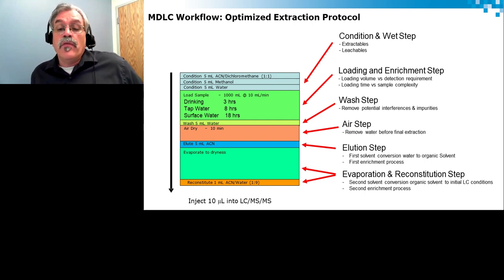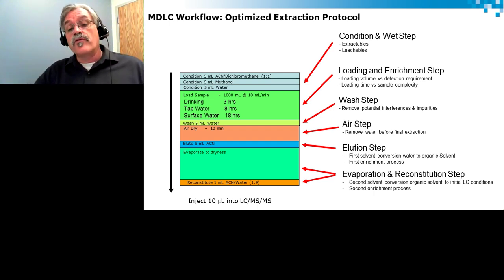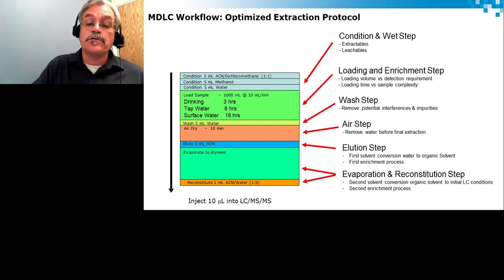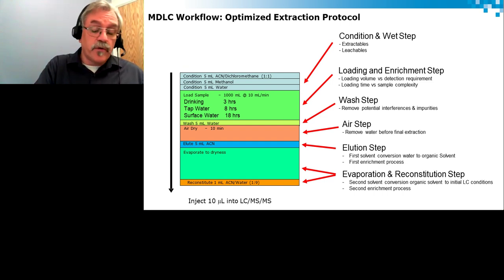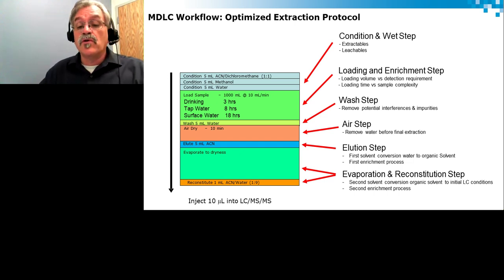Now, this is actually where a lot of extractions will finish. It's a common point for reverse phase chromatography. Because we start with a rough or raw sample, it goes into an organic layer. That organic layer has to be brought back down to dryness and reconstituted in an initial mobile phase. Usually the evaporative dryness and reconstitution can take up about 40% of any extraction method. Sometimes evaporative dryness could take several hours. I've seen over the years applications that will go up to an overnight drying step.